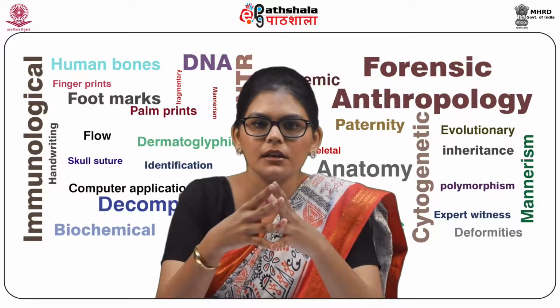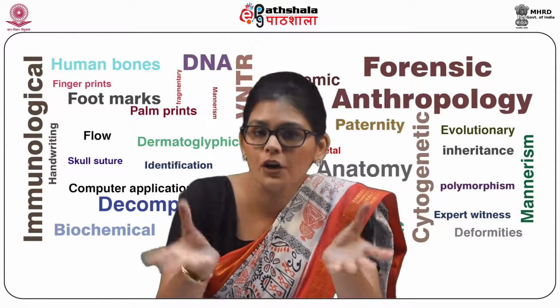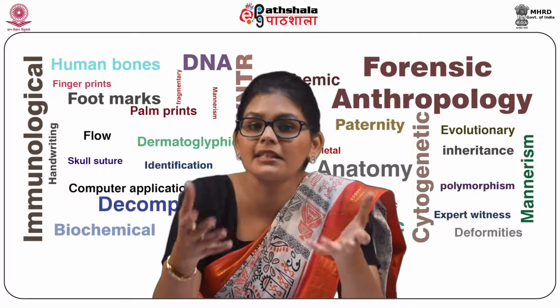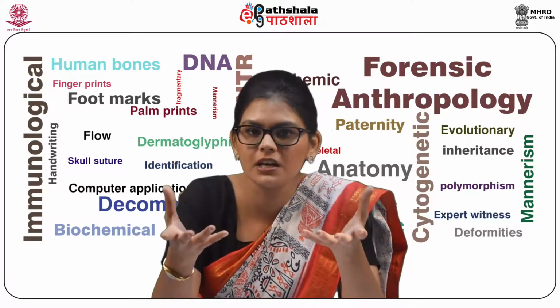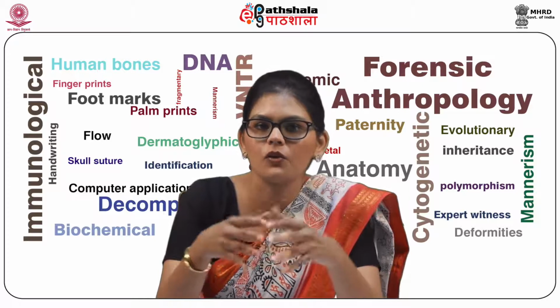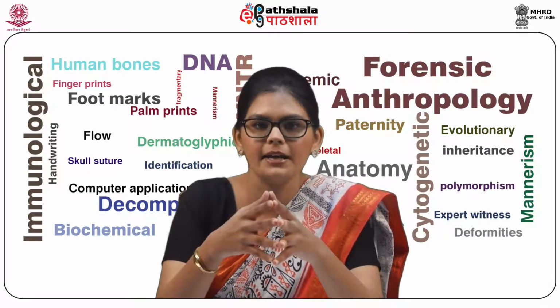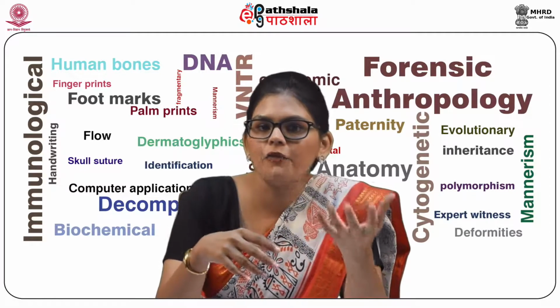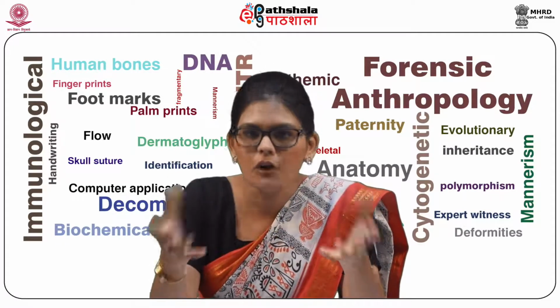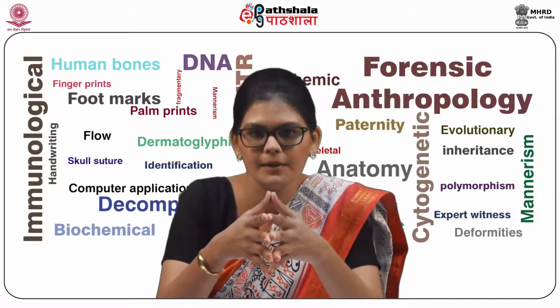Commercial fur animal hairs are very fine to medium and the overall diameter is 20 to 150 micron. The characteristic medullary formations are serial or vacuolated. Wide diameter variations are also seen in a single hair and hairs are generally banded. There is wide variation in the color and length of the hair specimen in the domestic animal group, which makes up the third category of animal hair.